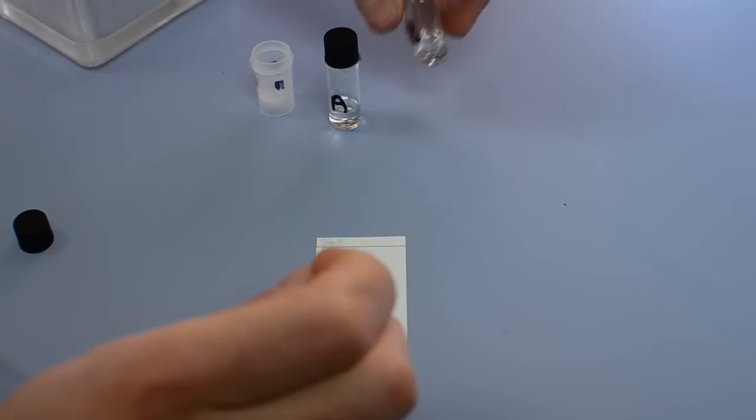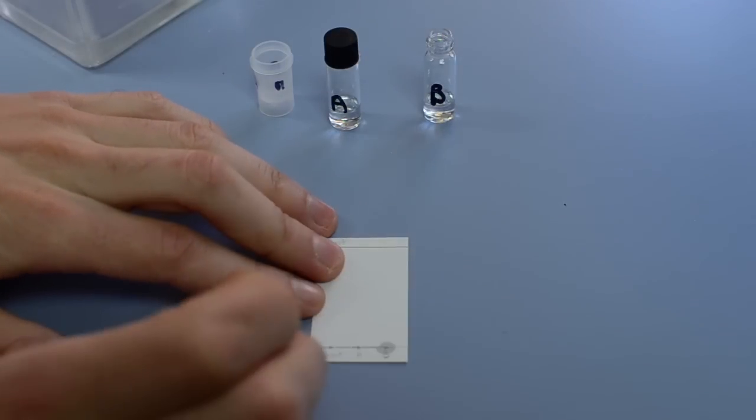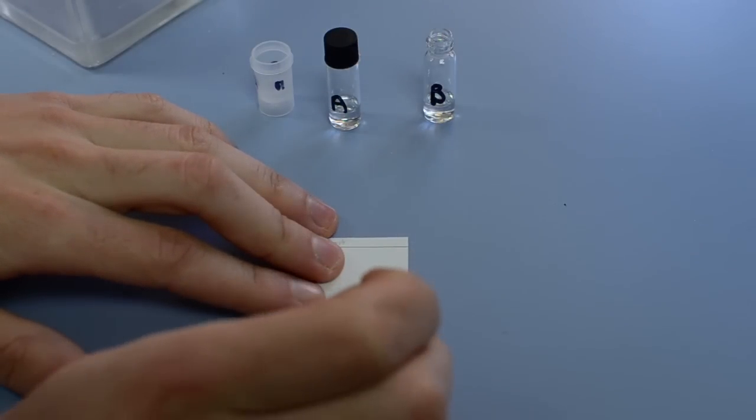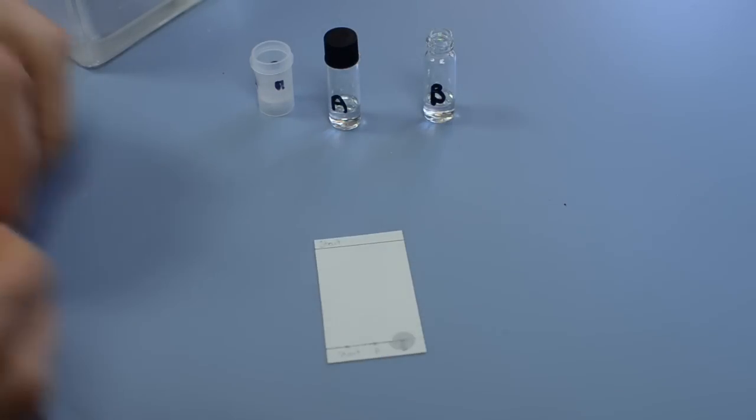Or you begin to notice other spots showing up, which might indicate other side reactions going on.